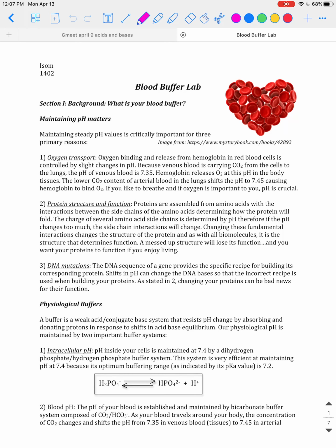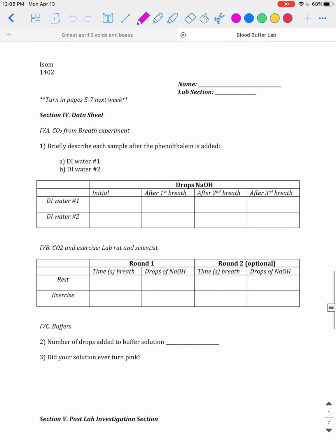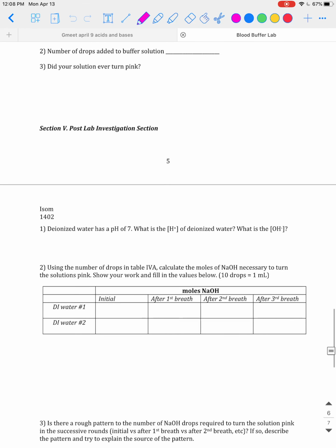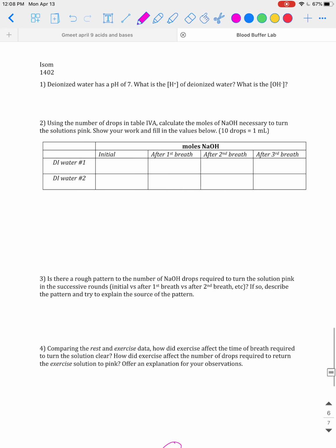Okay. Hi everyone. This video is an intro video to walk us through the blood buffer lab that we're going to do this week. All of the questions will be like, for example, the questions down here in the data, and especially the post lab. The post lab begins right here. I don't know why the header is on page 5, but it really begins on page 6.